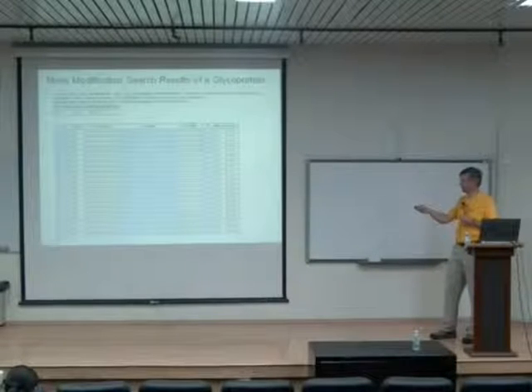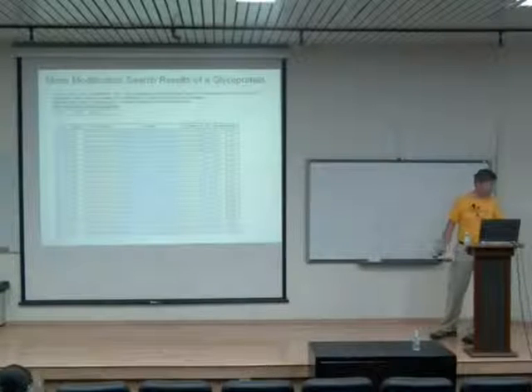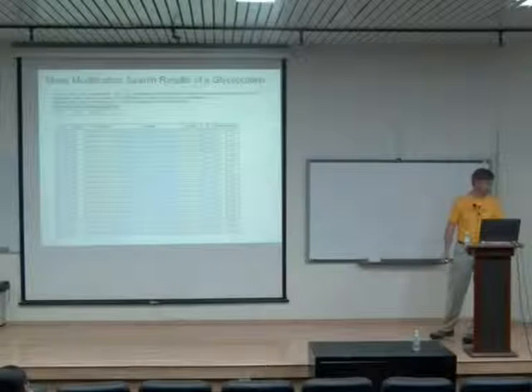And if the software was up here, I can give you a demonstration. If there's internet, you can click on this particular peptide, and it will show you the fragmentation spectrum for that particular one.